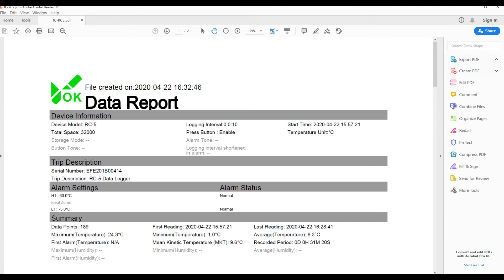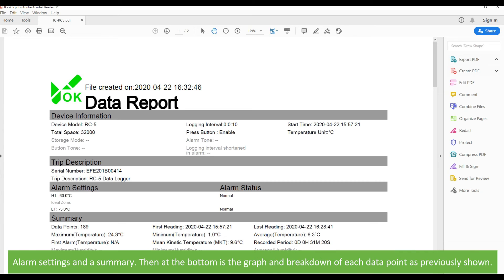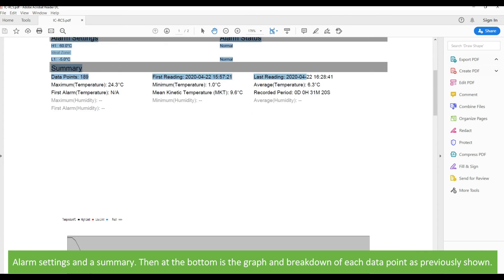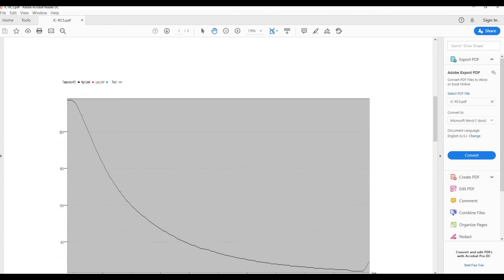Then at the bottom is the graph and breakdown of each data point as previously shown.